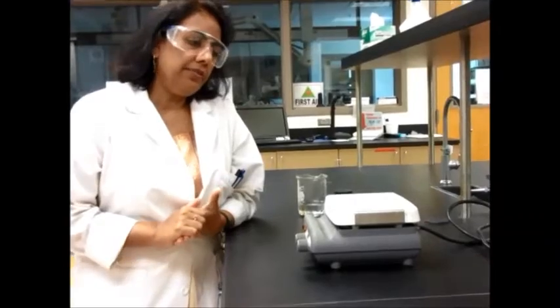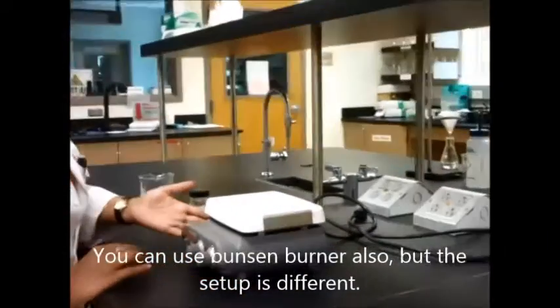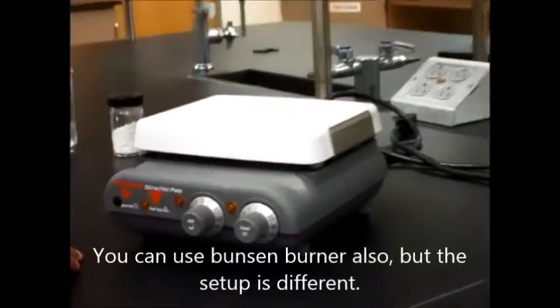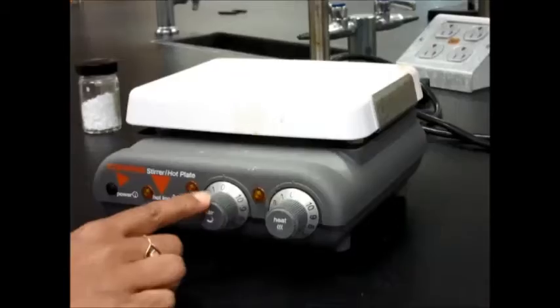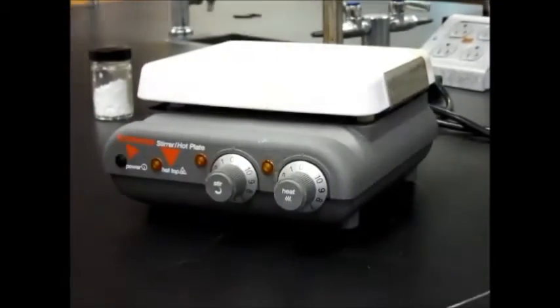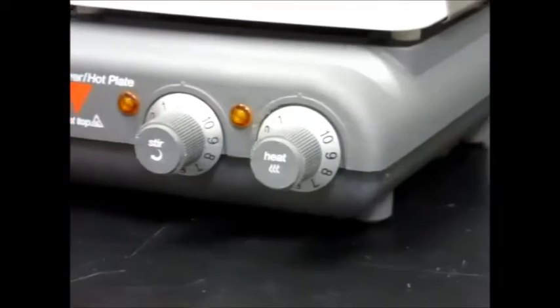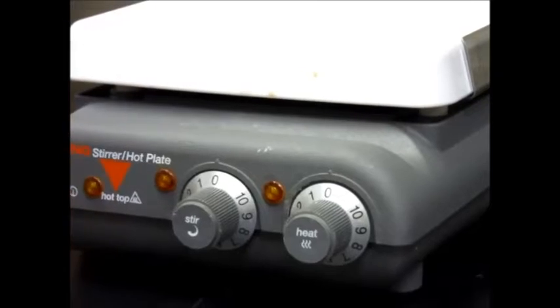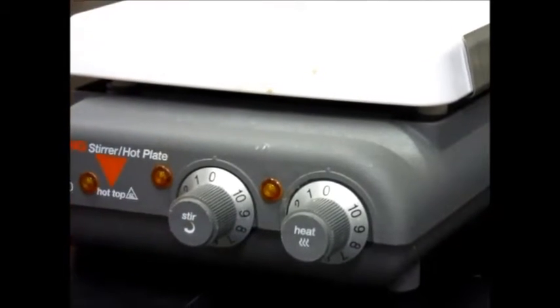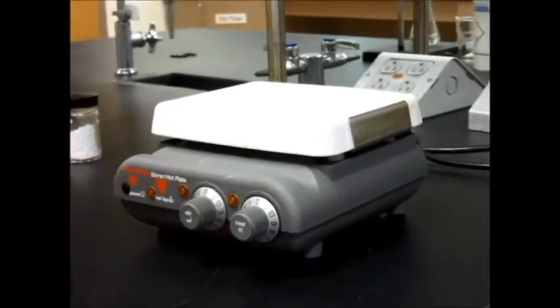For heating in the lab, you can have various instruments, and one of the most common ones you will find is a hot plate. A hot plate looks like this, where you have a flat top. You may have two controls or just one. In this case, there are two controls: one for heating and one for stirring. The stirring is magnetic stirring. Usually in general chemistry, you will not need the stirring — you will need more of the heat.